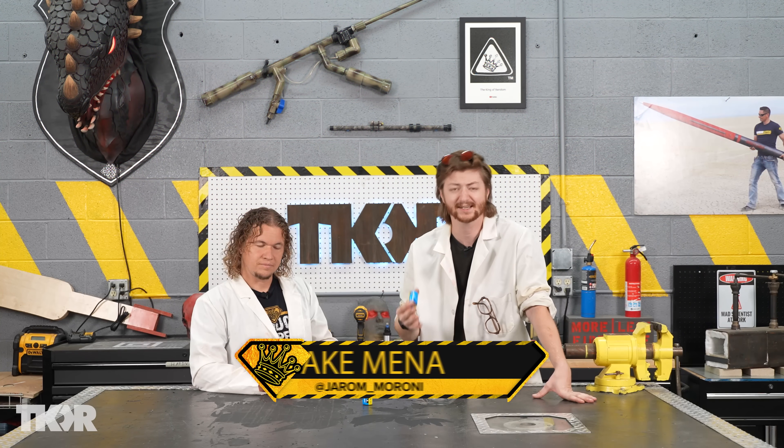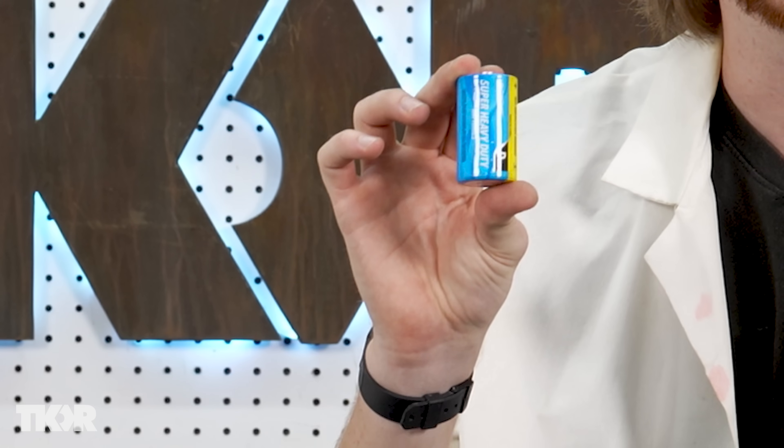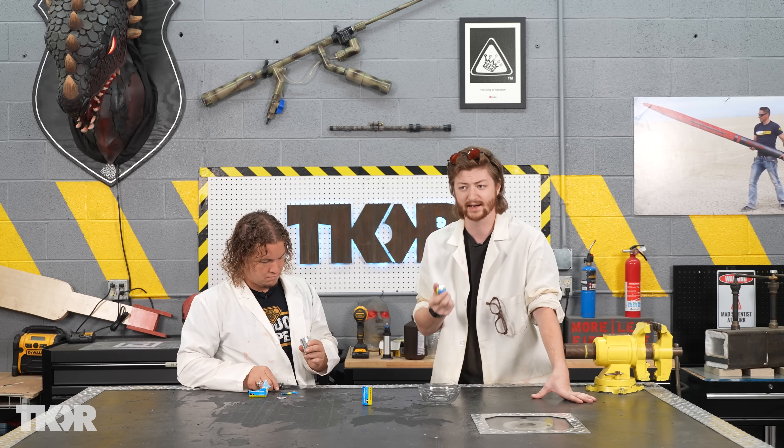The key ingredient we're going to be using today is called manganese dioxide, and it is found in these cheap zinc carbon batteries. I just went to the dollar store and found the cheapest D batteries I could find. You'll notice they're very light.